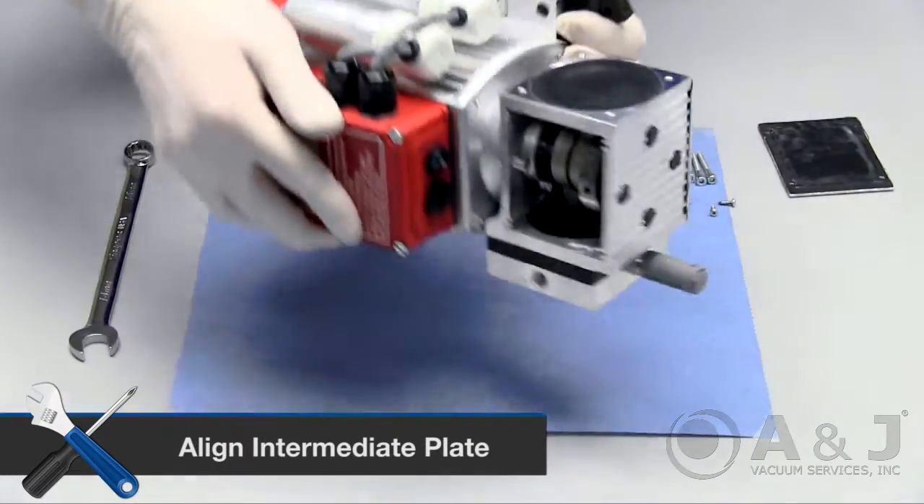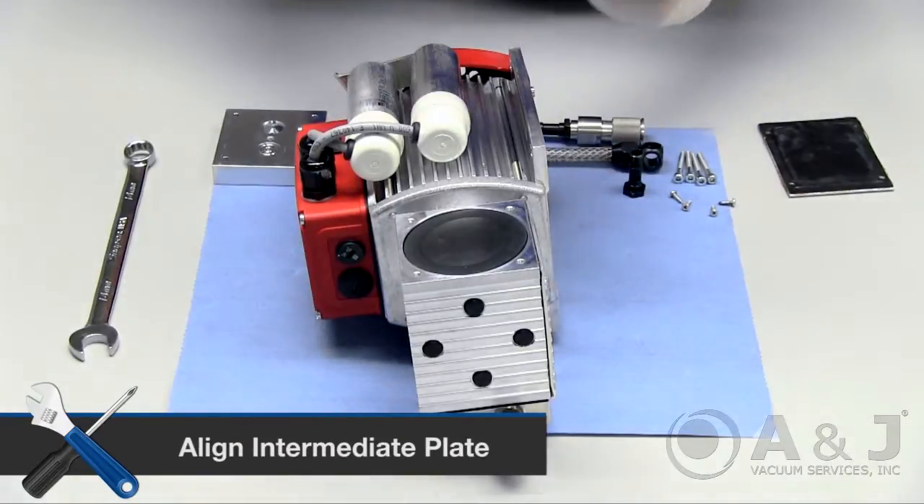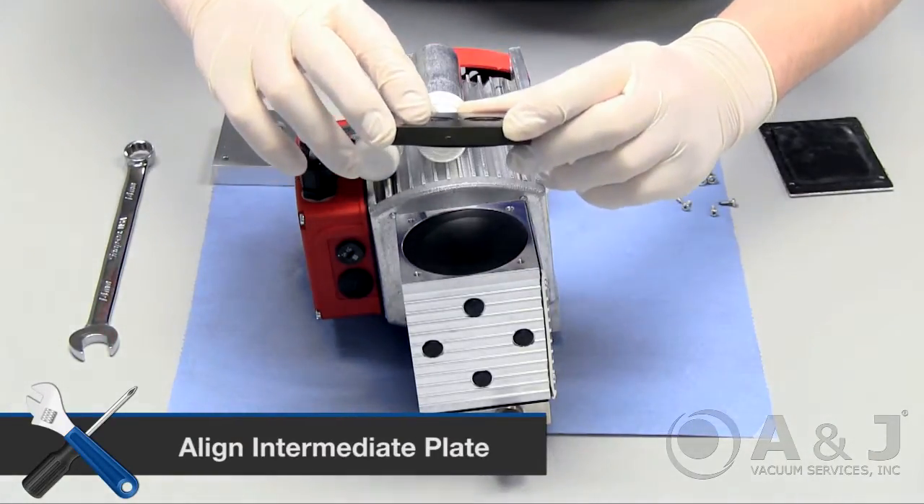Take the intermediate plate and make sure the number on the side corresponds with the side plate to ensure proper orientation and alignment.